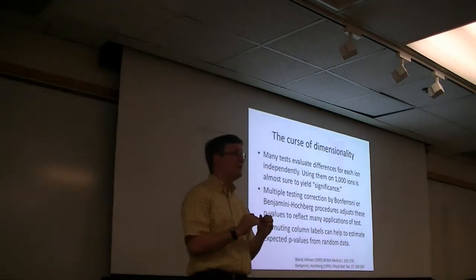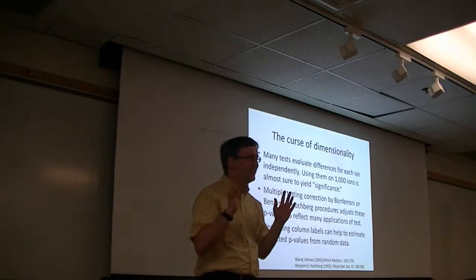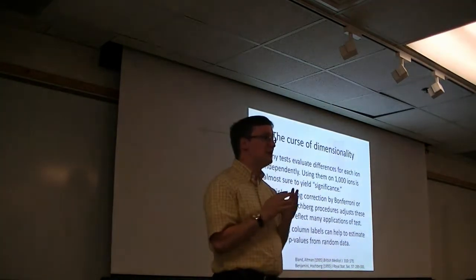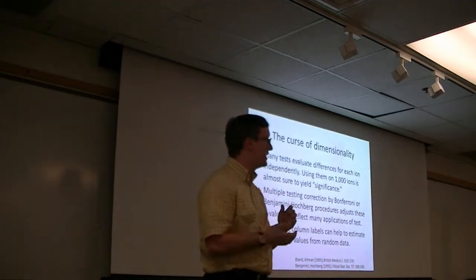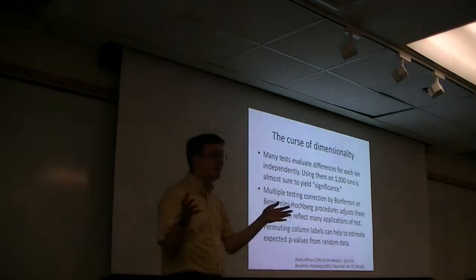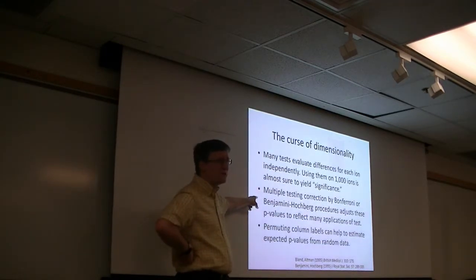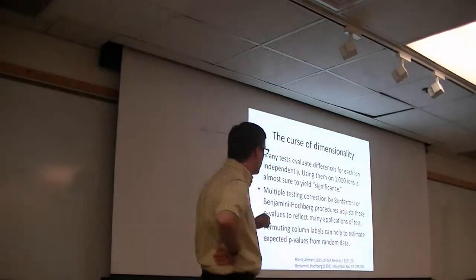Because frequently, we're not dealing with 20 metabolites, we're dealing with 20,000 metabolites, or 20,000 genes, or 20,000 proteins. So in cases like that, our ability to find significance has this little problem to it, that we have far more tests that we're performing than we have replicates to keep those values up. So there have been 2 major approaches that have fallen out for dealing with these. I'm also going to talk about a third as well.